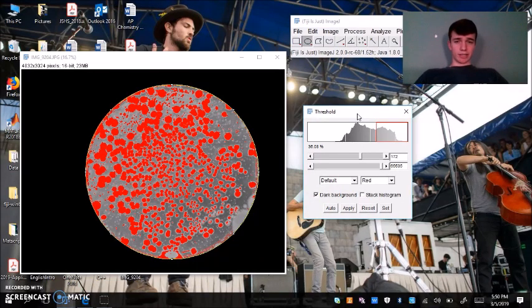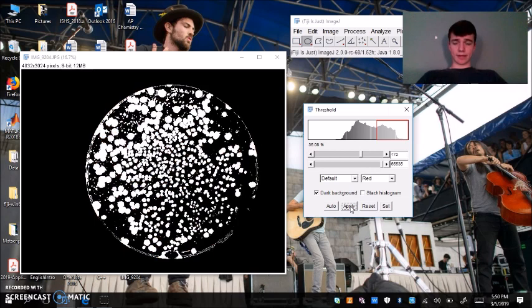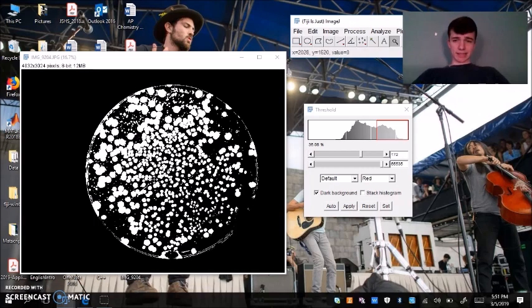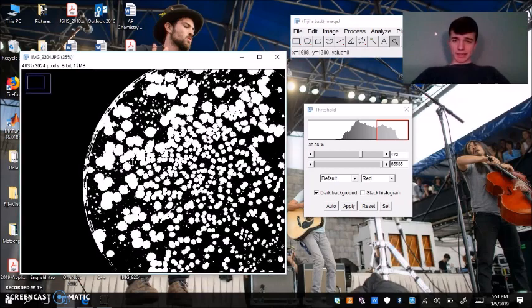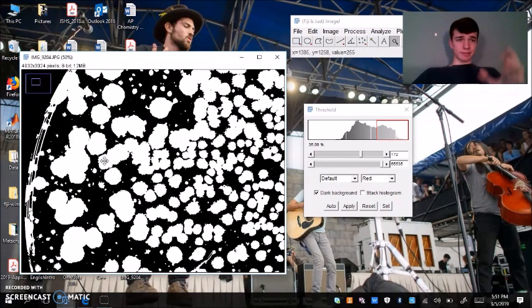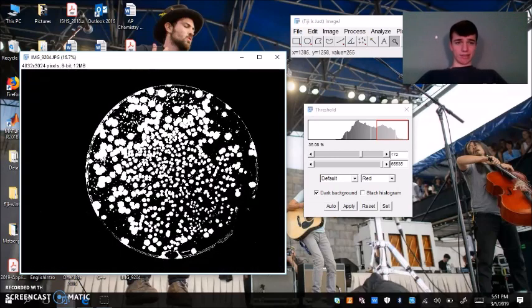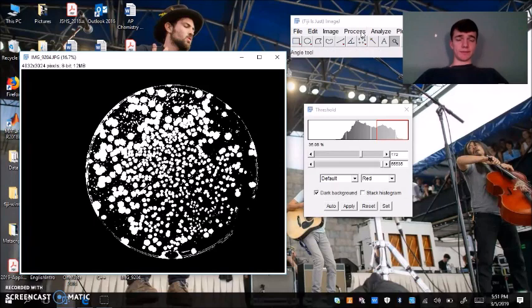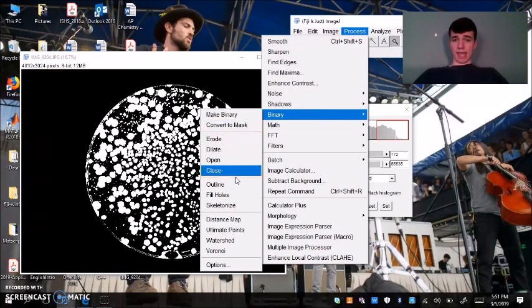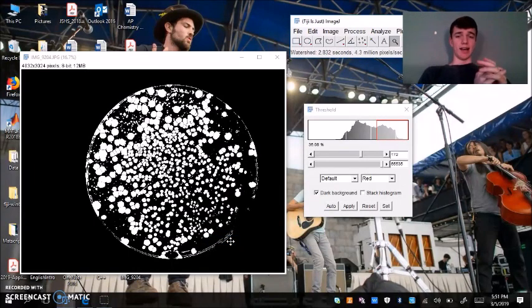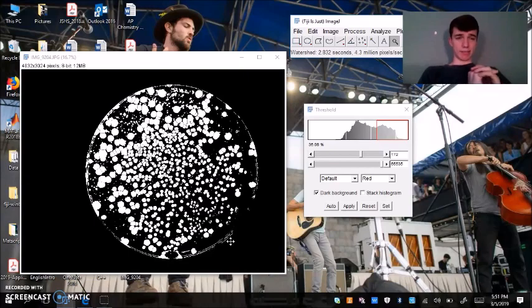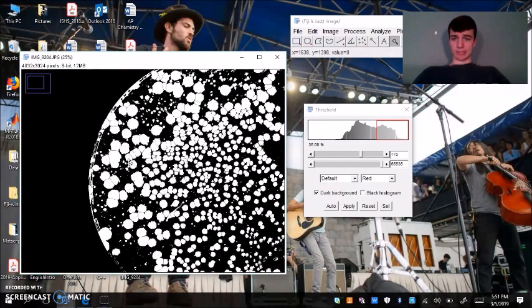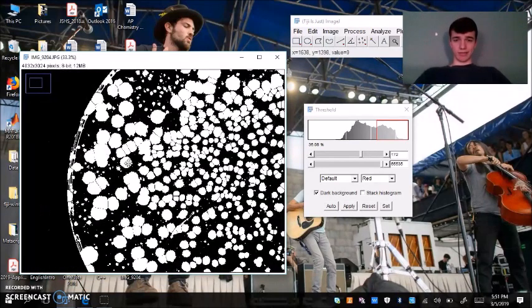Once you've thresholded your colonies, you're going to hit Apply. That's going to form a black and white image. What you might notice at this step is that a couple of our colonies have kind of merged together. That'll influence our final count number. So what we do here is we go to Process, Binary, and Watershed. What that command will do is based on the size and shape of our threshold, it's going to segment our colonies into different chunks that we can count.